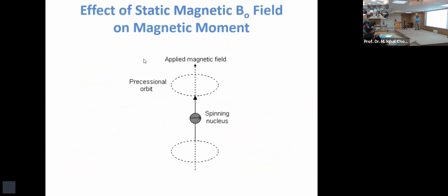And then this is precession frequency. Precession means a regular angular movement, and it's named as Larmor frequency, in recognition of Larmor. And this Larmor frequency is directly proportional to the magnetic field they experience, B effective, right? This is what you measure.